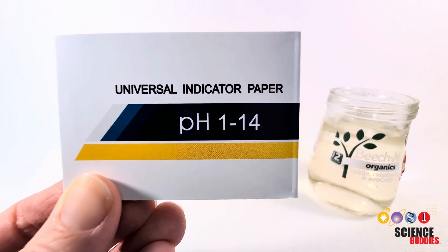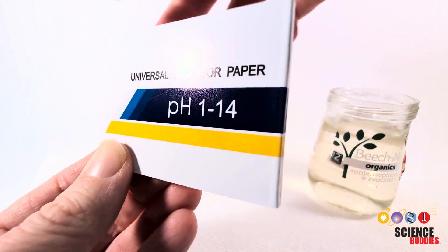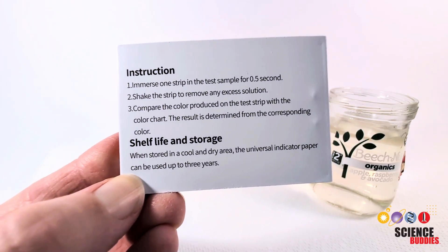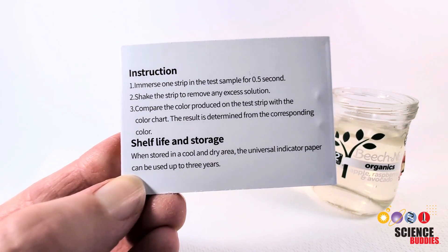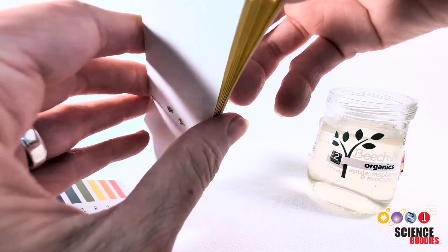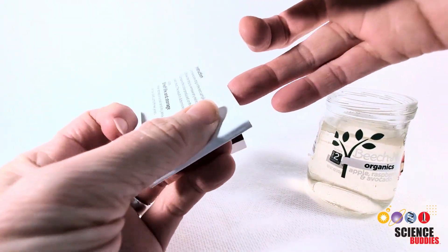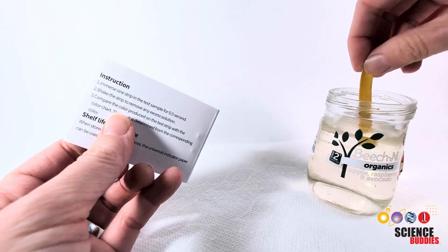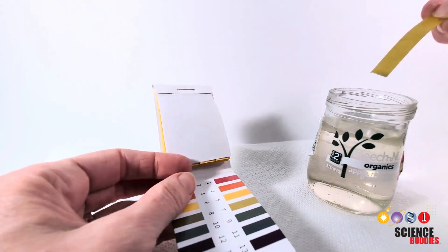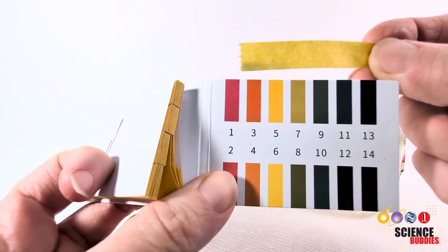Next we're going to test the pH of just the normal pond sample, and you can use pH strips to do this. Always read the instructions for whatever pH strips you're using. These ones say to just put it in the test sample for half a second, then shake the strip to remove excess solution, and compare it to the color chart. So it looks like our pH here is right around seven, which is what we would expect for the sample.